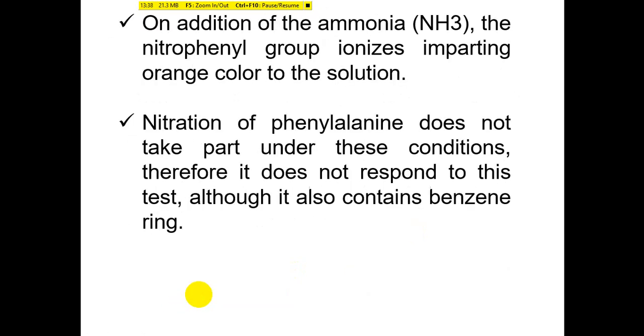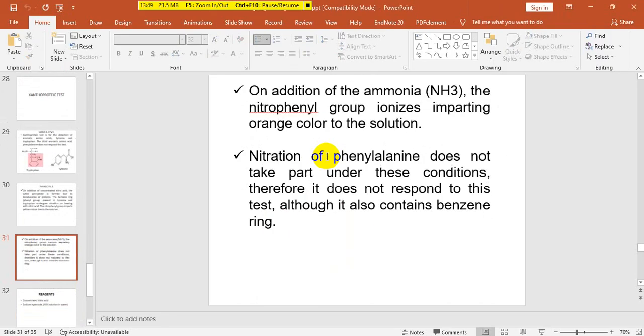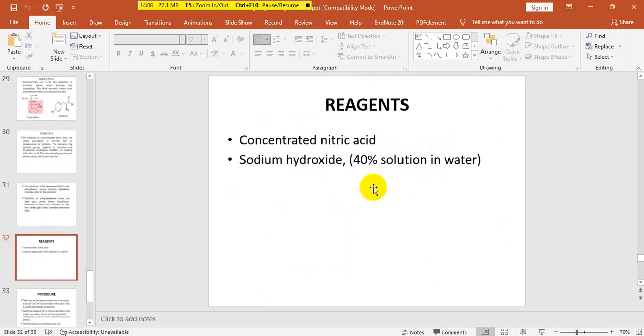On addition of ammonia, the nitrophenyl group ionizes, imparting an orange color to the solution. Phenylalanine does not take part in nitration under these conditions. Therefore, it does not respond to this test, although it also contains a benzene ring. So these are the reagents.